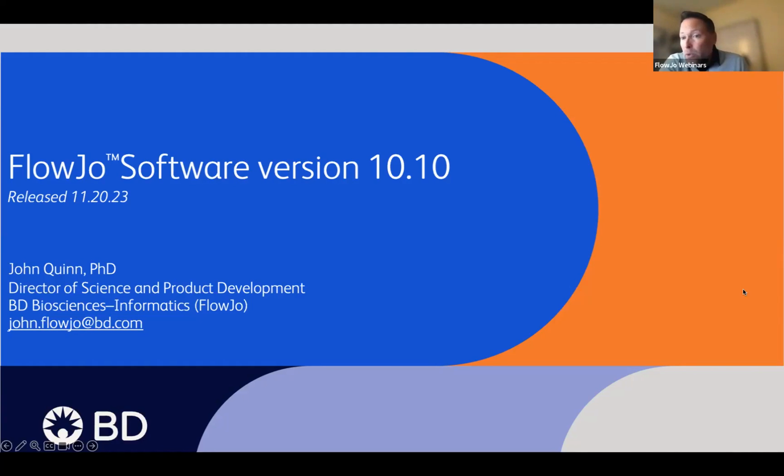One, you could run an automated algorithm. So there are a bunch of webinars on QC where we go through in some detail. A variety of algorithms are going to look for differences in flow rate, differences in signal stability, differences just in things that are in or out of the dynamic range, that we can have those algorithms clean the data entirely. I could also show if you just want to cut off, based on event number or time, where those events are. Also good, but I am going to start with the 10.10 stuff.